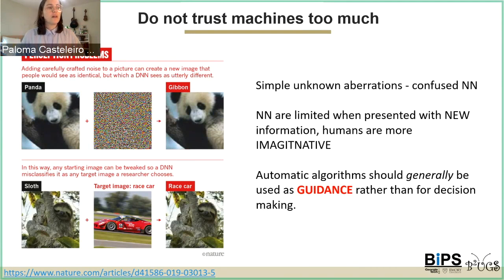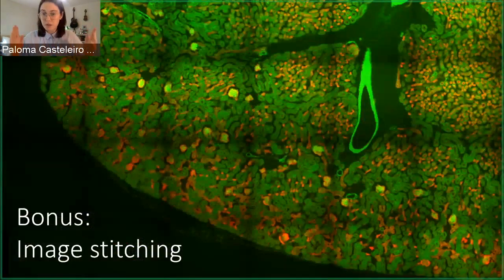And then there's one more topic that I want to talk about today that is kind of unrelated to this, but I think it's important to mention, because if you will be working with microscopy, you will run into a time where you need stitching to happen.